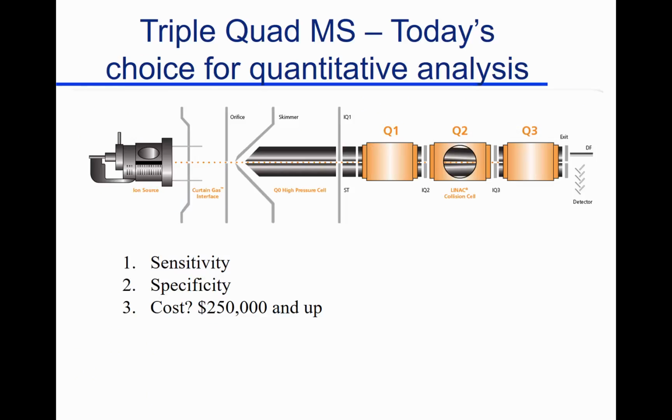And this is what we call a triple quad mass spectrometer. It has a single mass spectrometer here that selects a particular fragment, a piece that was blown up, bombards it again here and measures it again here. So again, it's just insurance that you're measuring what you want to or what you think you are measuring.